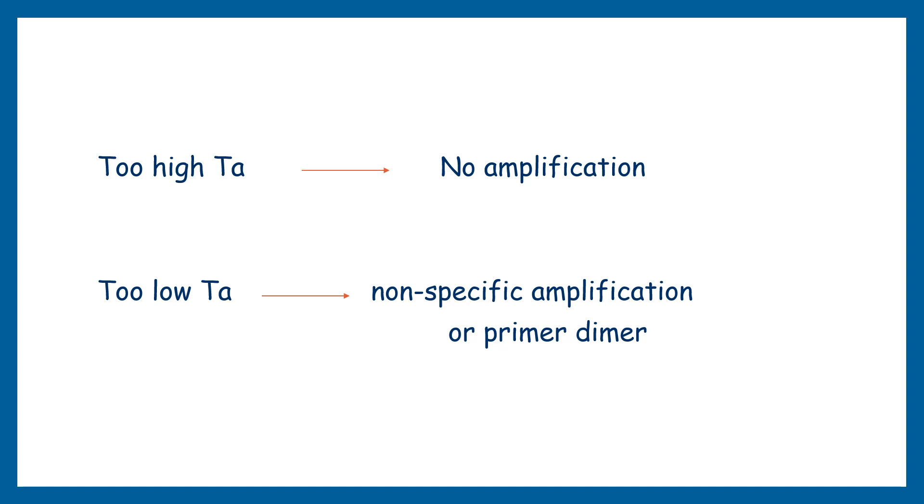To understand this step more accurately, we have to understand what happens during higher and lower annealing temperatures. If we talk about too high annealing temperature, we will get fewer or no amplification. In most cases, a higher annealing temperature leads to no amplification because when the temperature exceeds, primers can't bind with their template.